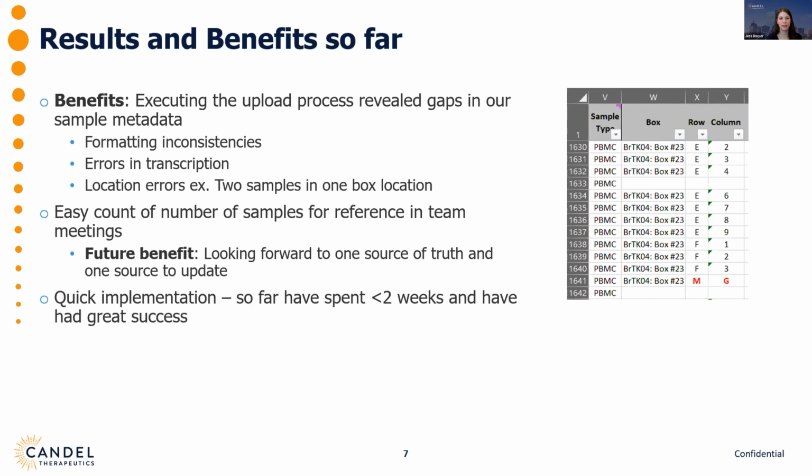It's also been nice, at team meetings, that I've been able to quickly pull up the total number of samples or aliquots to report back to the team. And I look forward to getting more skilled with the filtering and searching. As we begin to rely on Sample Manager even more, I think I'll be able to contribute directly using the software during different team meetings.